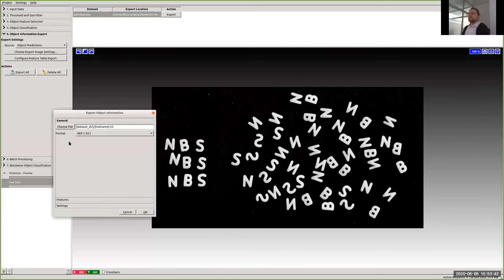That covers the immediate Q&A. There are more questions coming in — we'll try to answer them inline while Dominic carries on. What I want to show next is how to deal with situations where you have very crowded cells and you still want to separate them into individual segmented cells. You can do this in object classification.